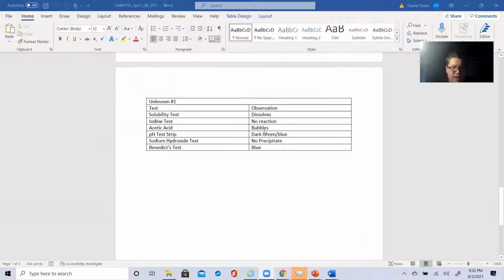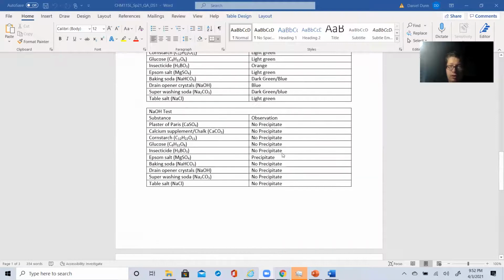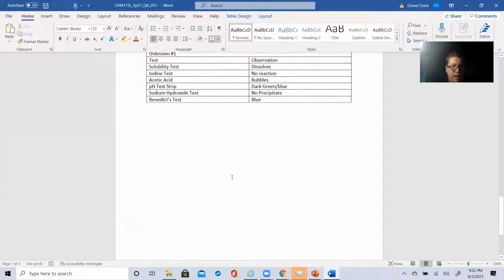Okay. What about acetic acid test? It bubbles. Well, that's good. That narrows it down, right? So it's got to be between washing soda, baking soda, and chalk. But it can't be chalk because chalk is not dissolved. So now we're between two. Great. What's the next one? pH. So it's going to be dark blue. Ooh. Let's find out. So which one's dark blue? Dark green, dark blue. Ooh, they're both going to be kind of bluish color. That doesn't help us.